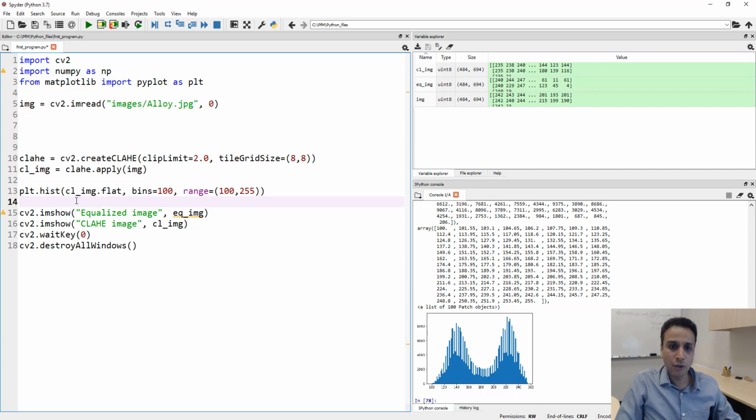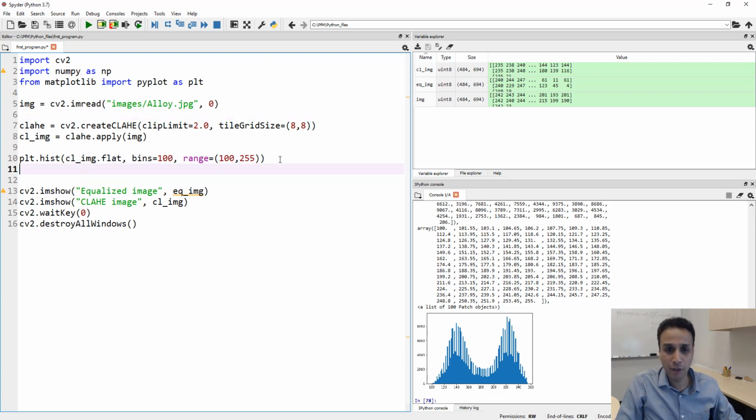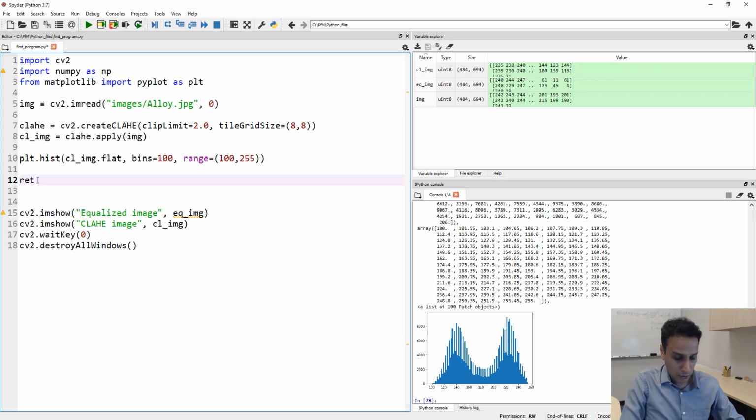So now let's just do our histogram segmentation. Let's clean this up. And how do we do thresholding? Again, our segmentation, if you want to call this. Here in OpenCV, it's cv2.threshold. Okay, so let's do return thresh1. So this is the thresholded image. Ignore the first argument first. We need to unpack both, otherwise it's going to throw an error. So I'm going to just put a dummy like RET right there.